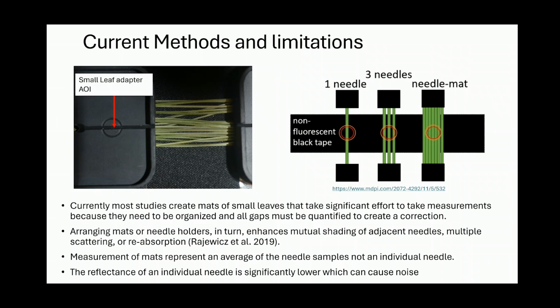And as you can see here on the top left, we have our pine needle adapter. The needle slots into that line where the red arrow is pointing, and is held stationary for repeated measurement and very precise measurement of a single needle.